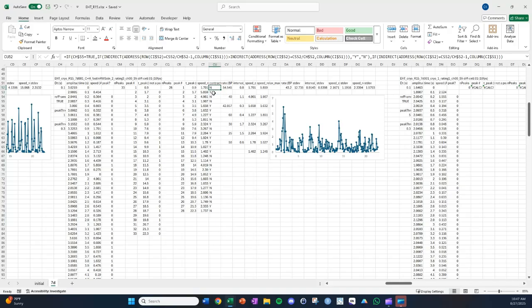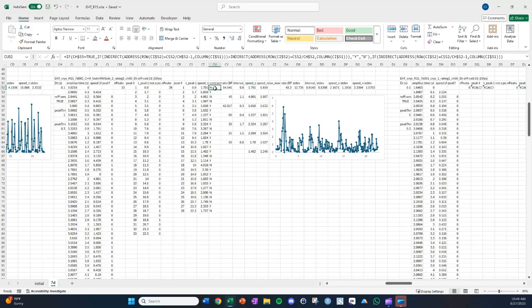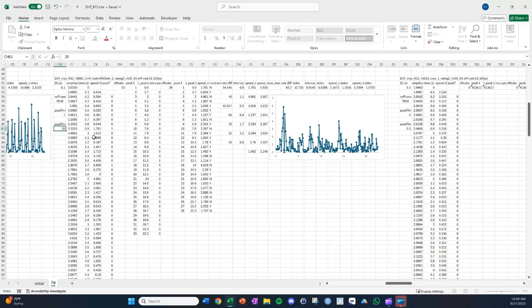But at any rate, one of the points of this, in addition to identifying this correctly, which it's not right now, we need to change that, but get to that later. The point is that in this column, what you want to see is relaxation followed by contraction, and so on like that. It's not doing that, which means that some of these peaks are in fact not real peaks. So what you can do is try to change that. We're going to try to eliminate more peaks by increasing the value. So that eliminated a couple more peaks. Pretty good, but you can still see here, it looks like it's reporting 2 contraction peaks following each other. That doesn't make any sense. So we're going to keep changing it.